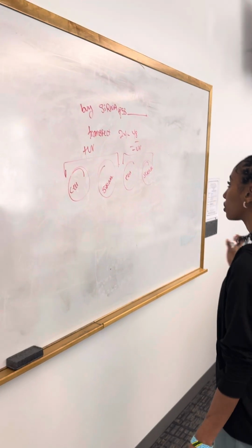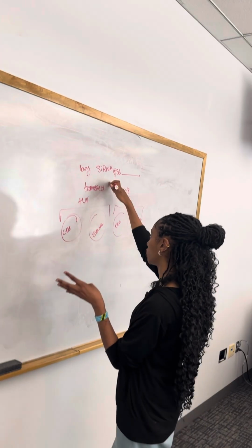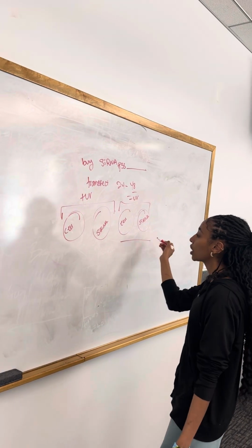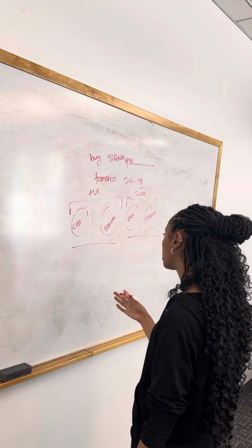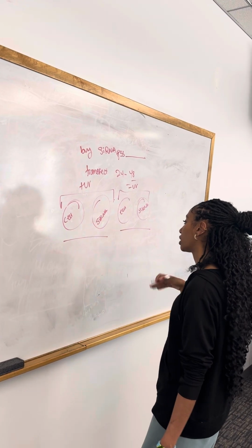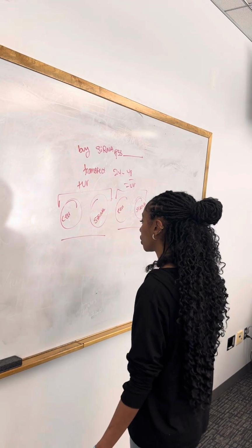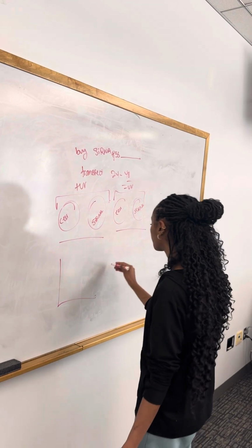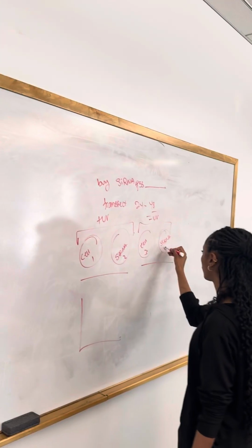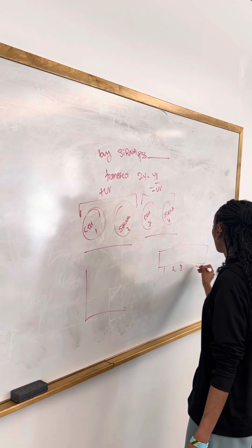Okay, so P53 protein is formed in the first place when there's damage in the cell. So if there is no damage in the cell, we shouldn't expect P53. But if there is damage in the cell, we should expect P53. However, if we transfected the siRNA, we shouldn't expect any P53. So we're gonna do the qPCR and a Western blot. I'm gonna call them 1, 2, 3, and 4, and then Western blot here, 1, 2, 3, 4.